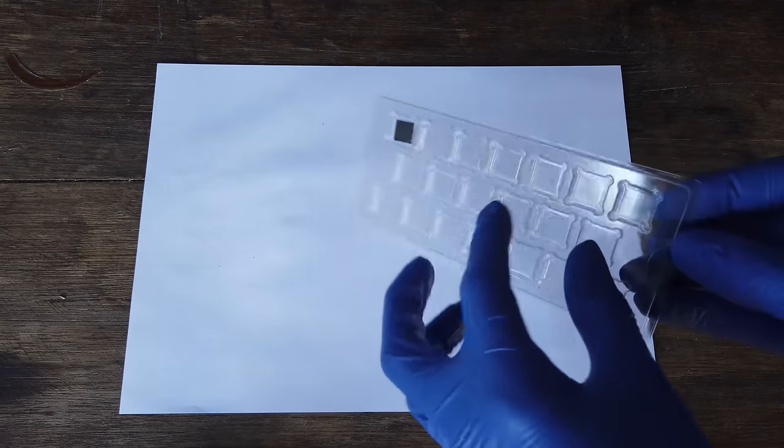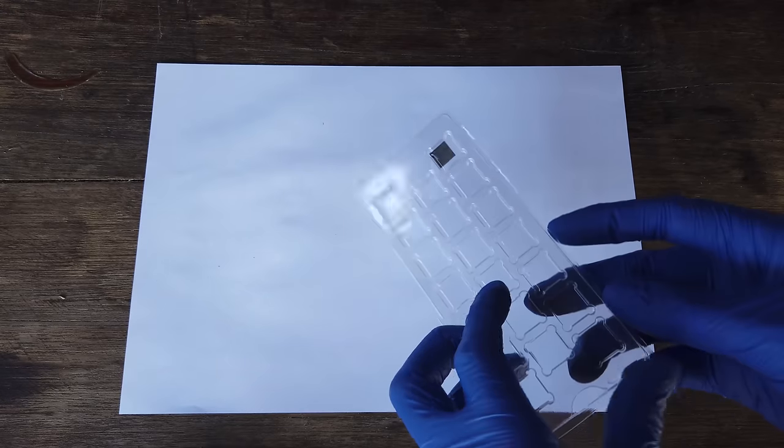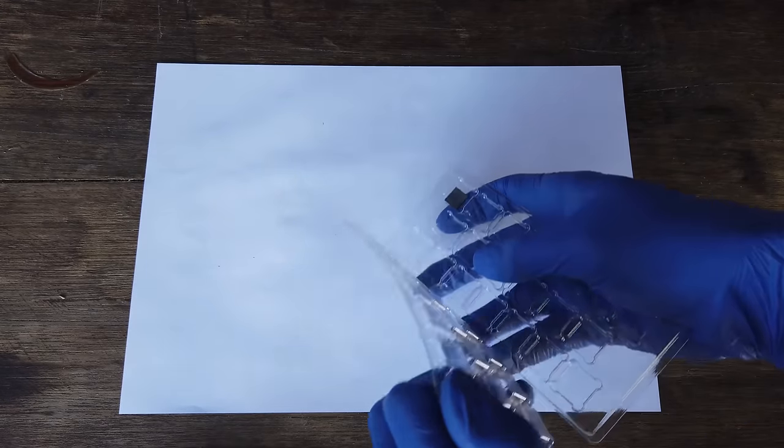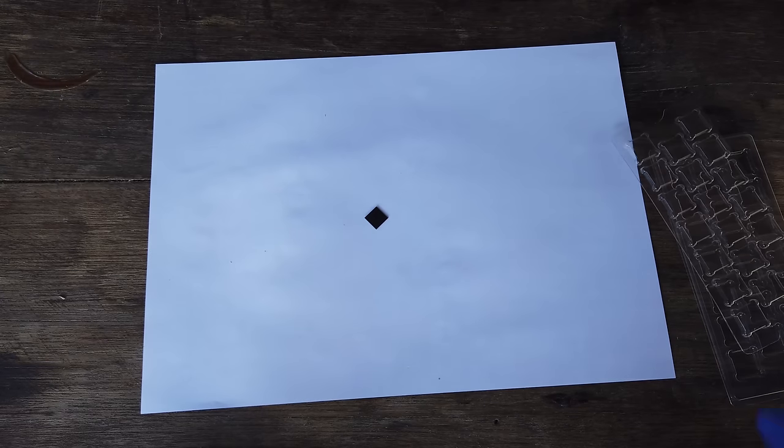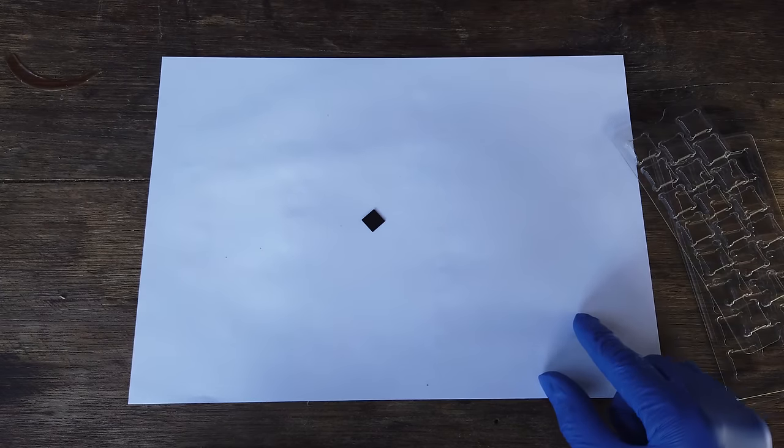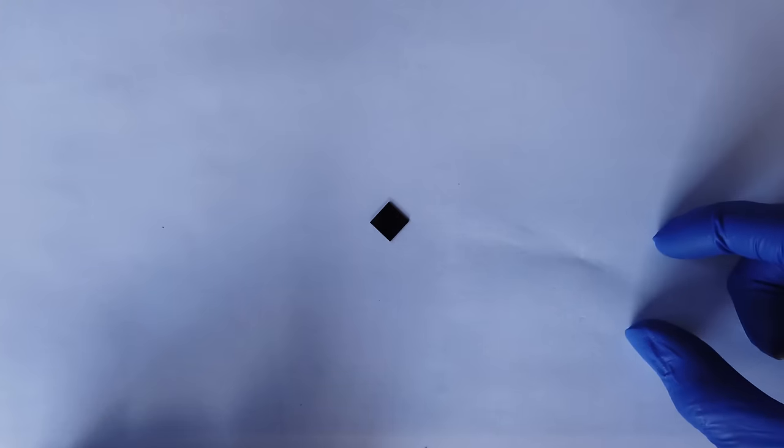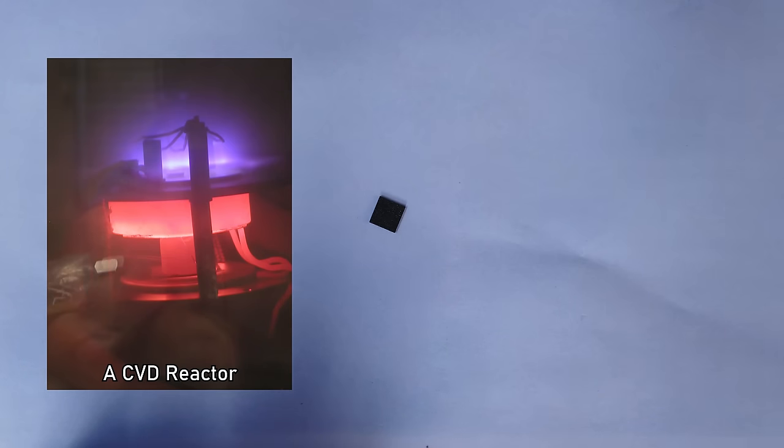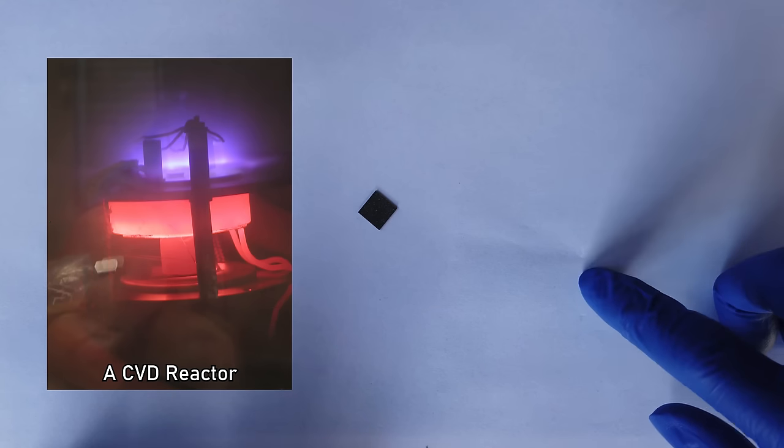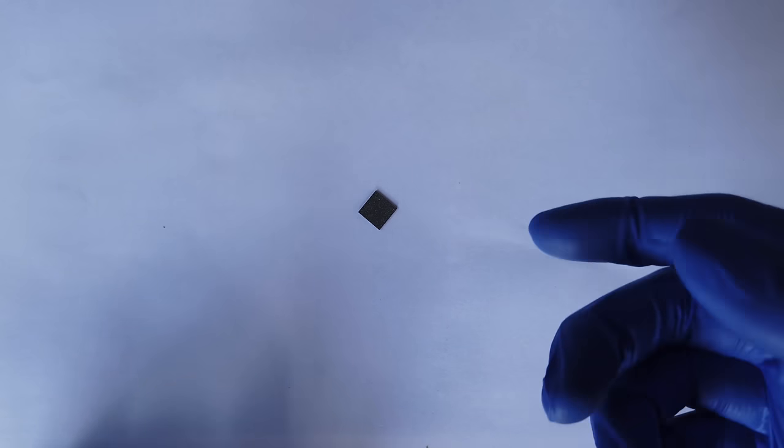So cautiously we're going to open this up and get this material out. Nice. Now if you've already figured out what this thing is, well done. If you're not an electrochemist, I'd be surprised if you've ever seen or heard of it. This is diamond. Artificial diamond grown by chemical vapor deposition, hence why it's in the shape of a little square. Now there's nothing all that special about a lab-grown diamond, but this piece of diamond specifically is made to be doped with like 0.2% boron. That's what's making it this color.